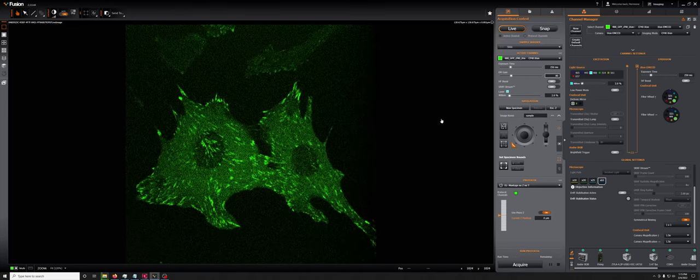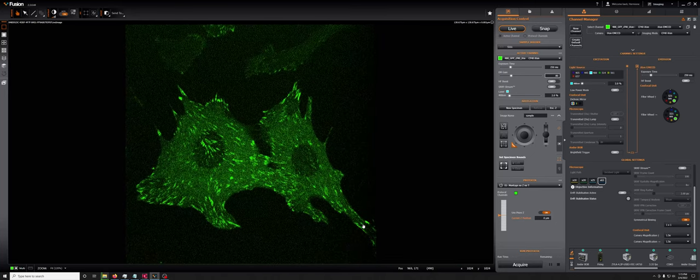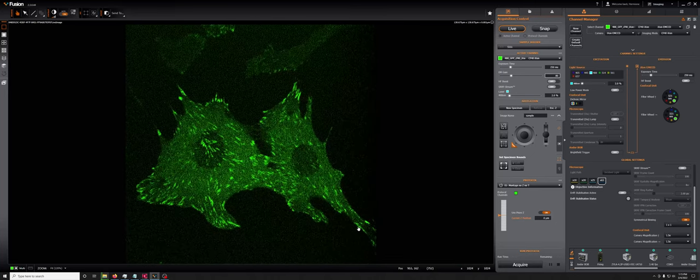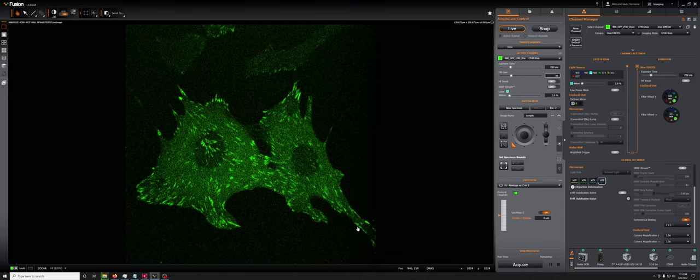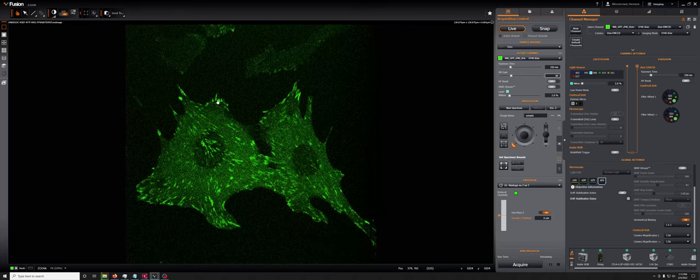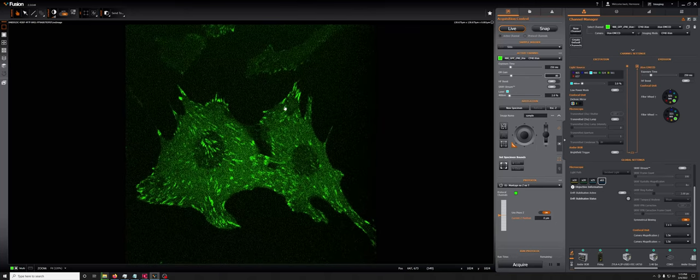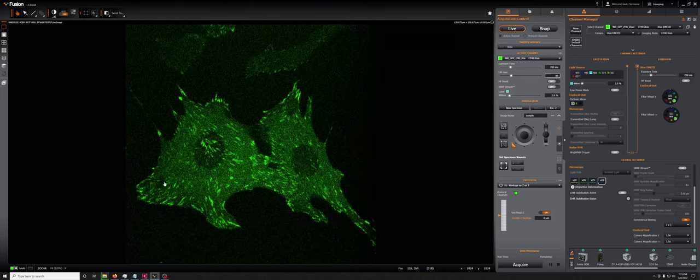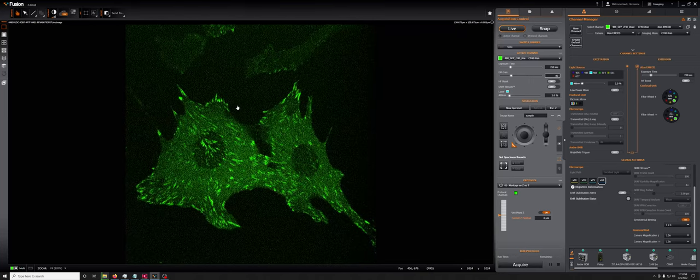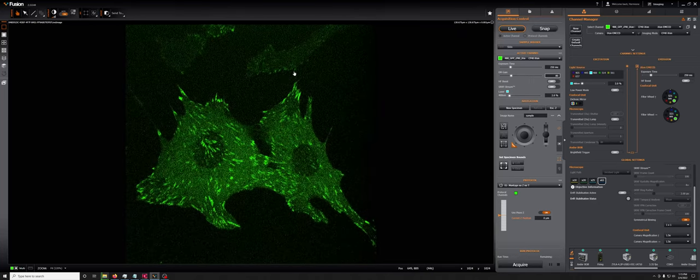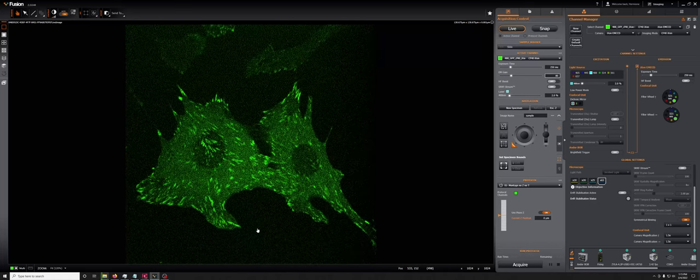One important point is that when you're making these evaluations of whether the signal to noise is improving or not, you're comparing the contrast of objects that you have some idea that might be real, like all these things here with background. The noise essentially where there's nothing.